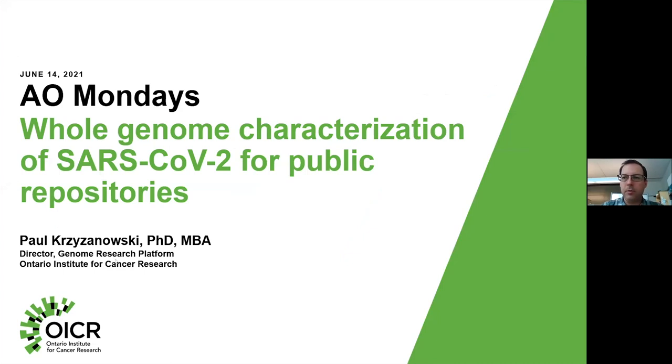Okay, I'm assuming everyone can see my screen properly. So today I'll be talking a little bit about what's going on under the hood when we talk about whole genome characterization of SARS-CoV-2 samples for public repositories. I think as many of the audience know, there's been a lot of activity within OICR supporting various initiatives around the province over the last year.